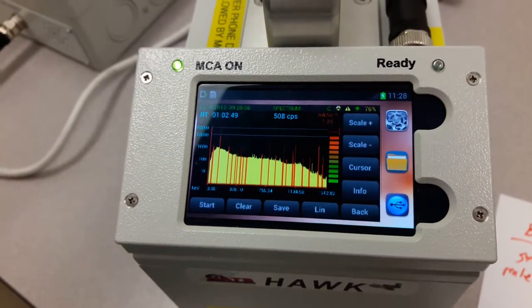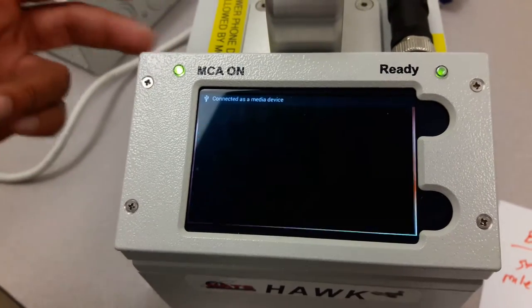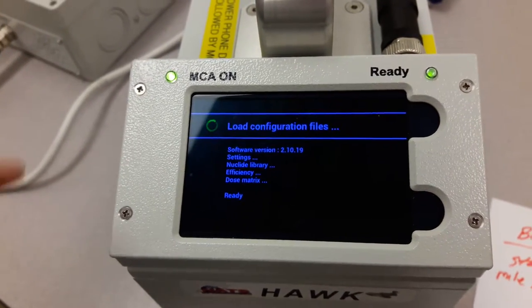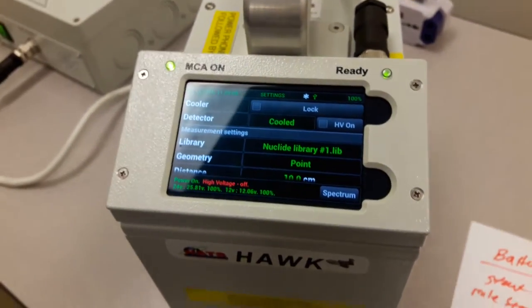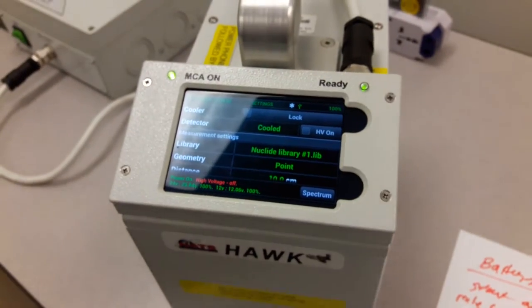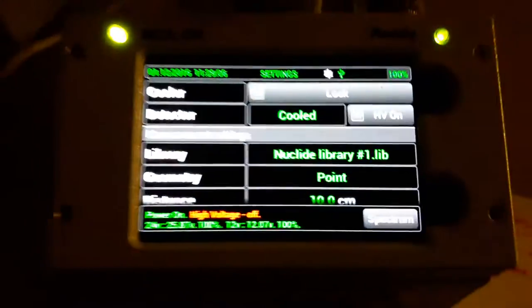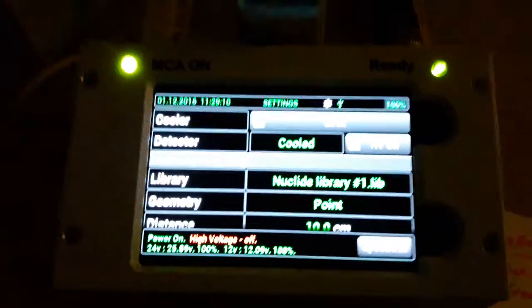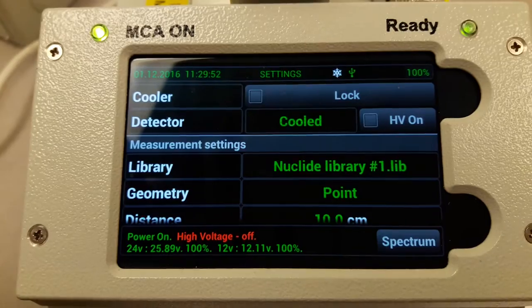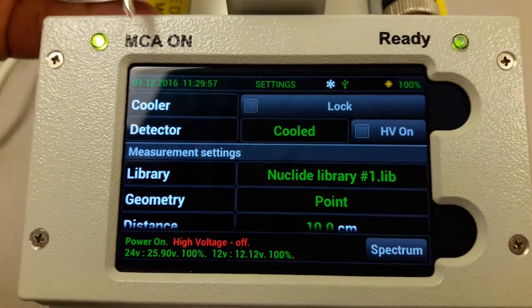What I suggest is that you turn on the phone first, and while it's booting, then you turn on the MCA. Then it connects to the device, loads all the configuration files, and now it tells me that my detector is cold. Now that we have booted up and the MCA main screen is on, let's go over the menus.